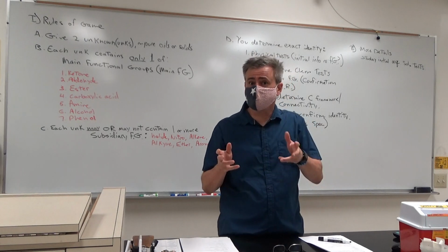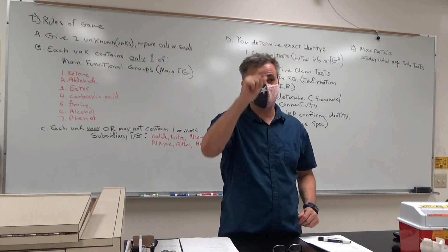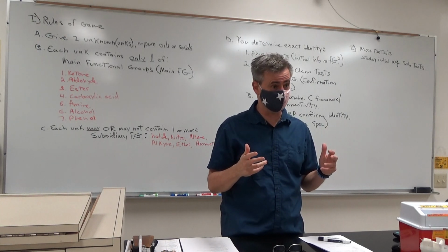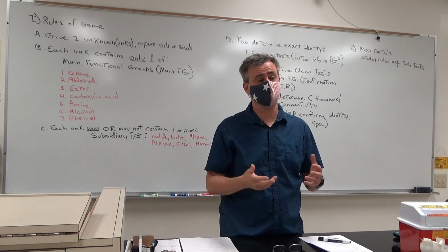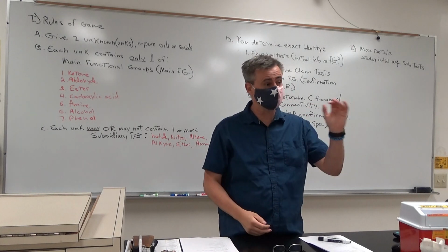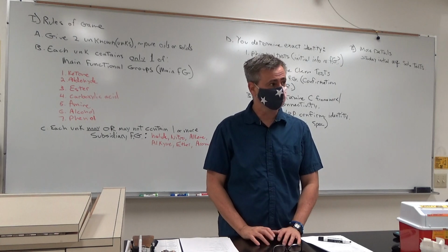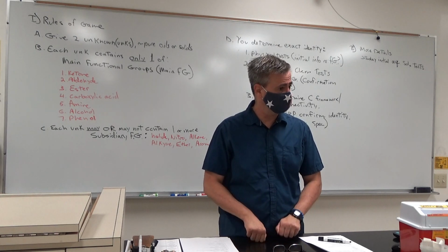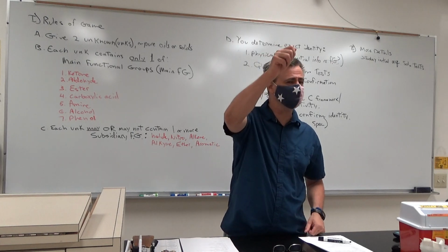If you're doing the 2,4-DNP test, over there is a ketone standard that you should do so that you know what a positive test looks like. You could even do that for the solubility tests. Students love to come up and ask, is this a precipitate?